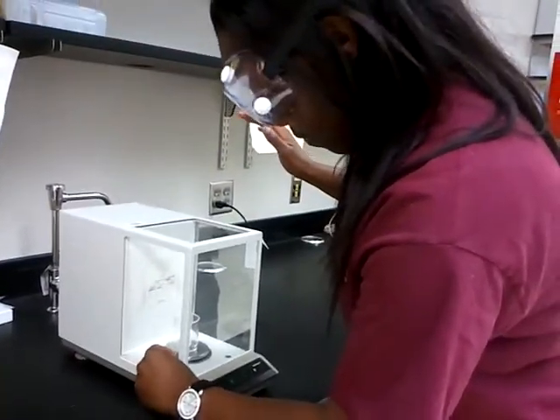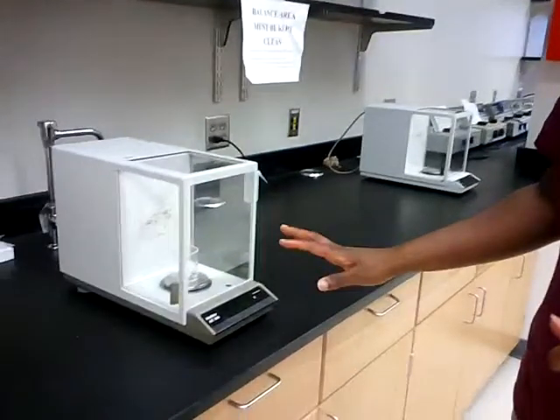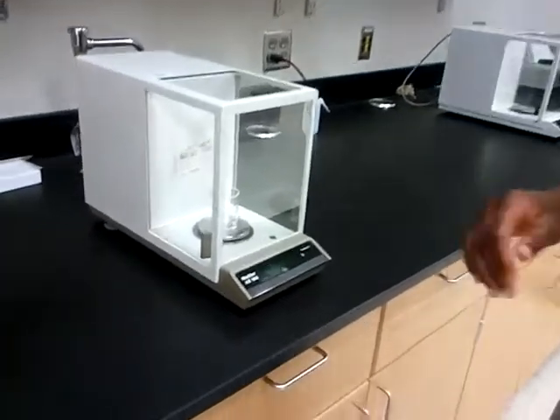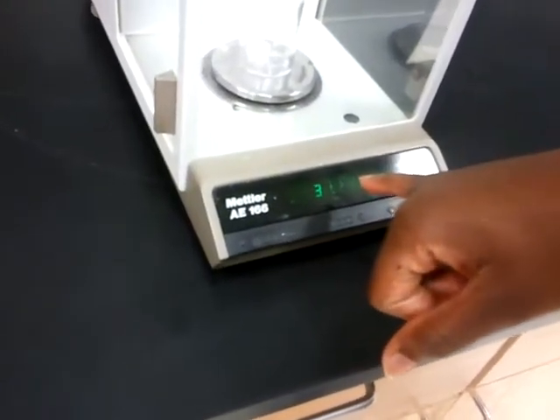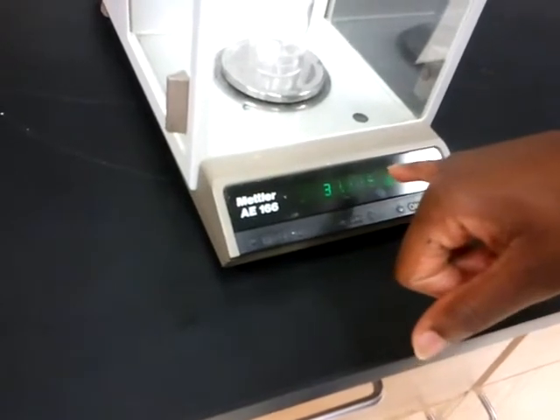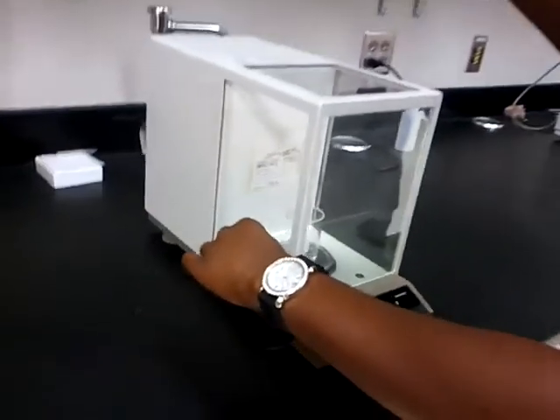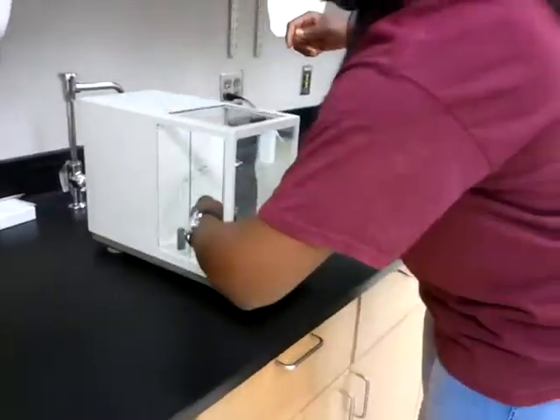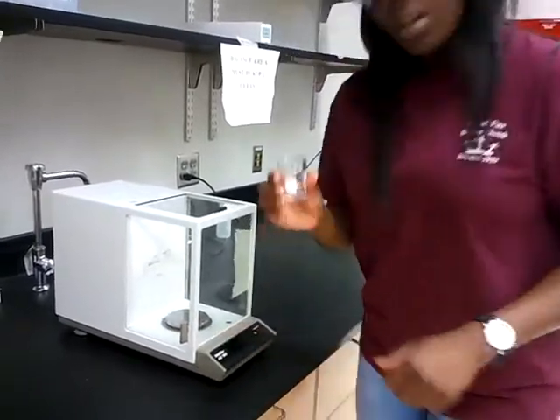Close your door, and then stand back, making sure we don't touch the counter or anything to alter the results. And so we see here it's measuring 31.12. We'll take that as our measurement for the initial mass of our beaker. Okay, and now we'll proceed to continue to measure out our liquids and get our calculations.